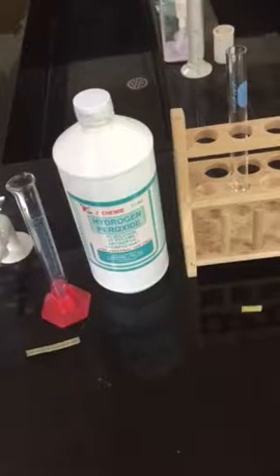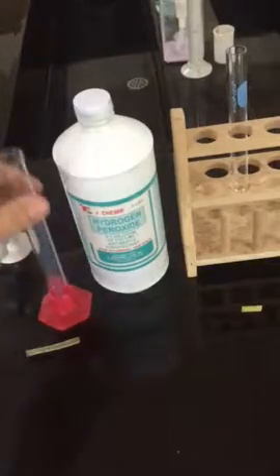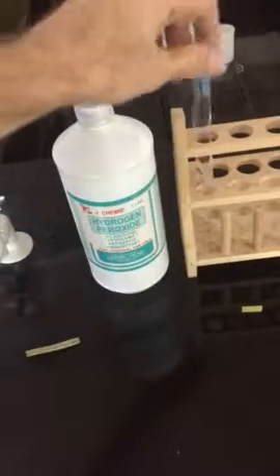I've already cut a 2 centimeter section in advance for this. So again, that's something that you're going to want to measure and keep consistent unless that's the variable that you're changing. So all we need is, I've got 5 milliliters measured out here. I'm going to pour it into my test tube. Okay. So again, that's going to be a measured quantity that we want to keep constant. Put that on the rack here.